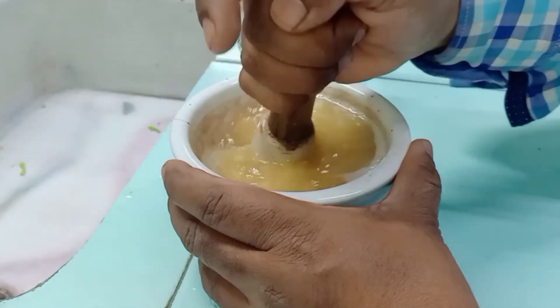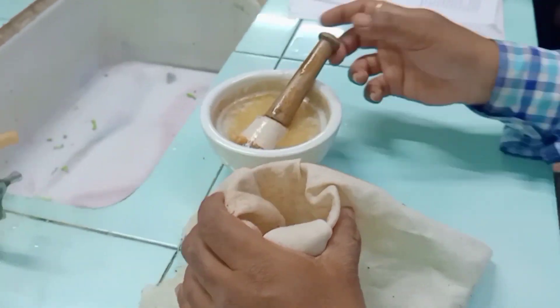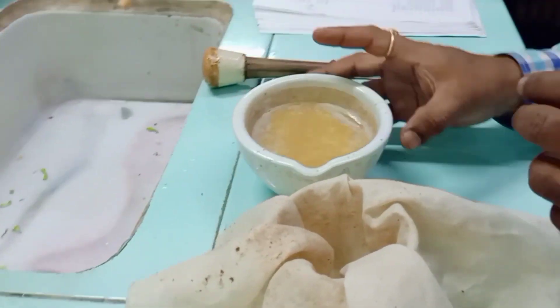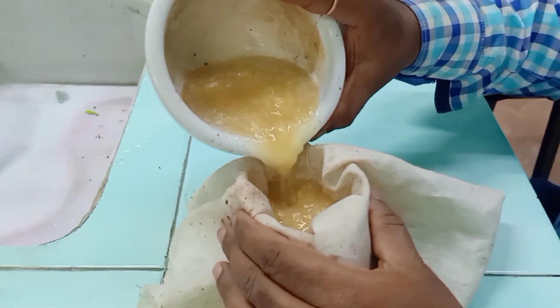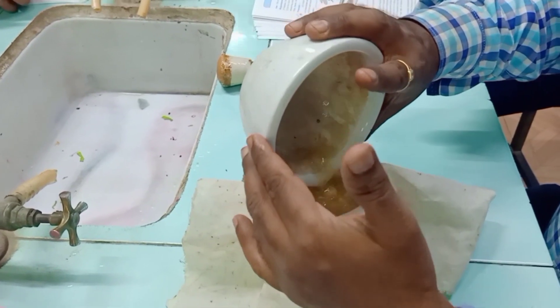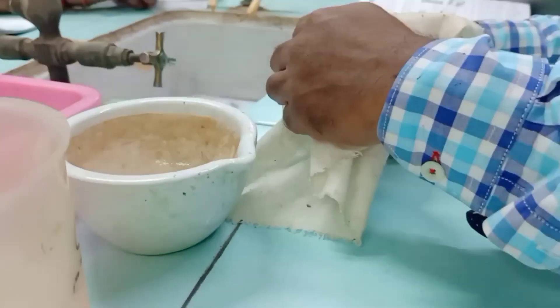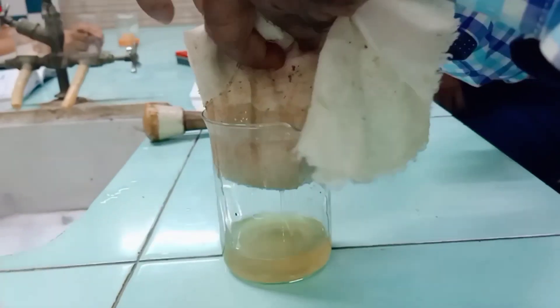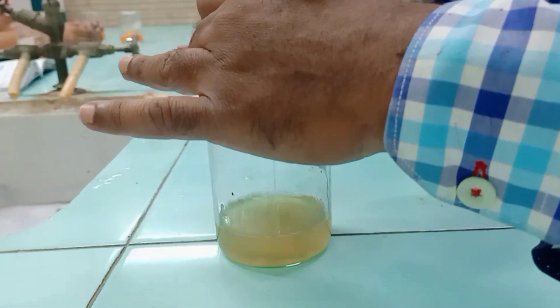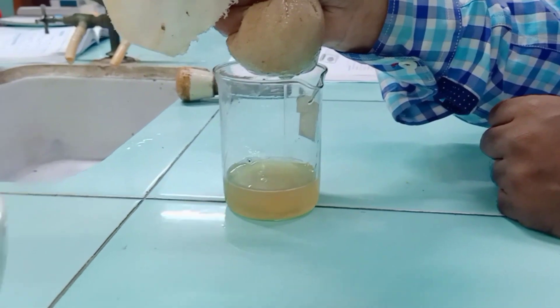To filter it, take a beaker and place the muslin cloth inside — keep it slightly inside so it doesn't overspill. Pour the banana mixture through it. All the lysed cell contents — DNA, RNA, proteins — will get filtered and come down. Squeeze gently through the muslin cloth, as we do not want the pulp to enter. This gives us a sufficient amount of extract.